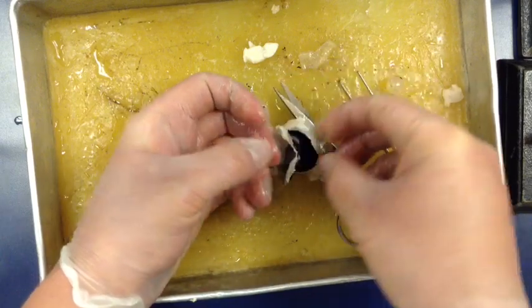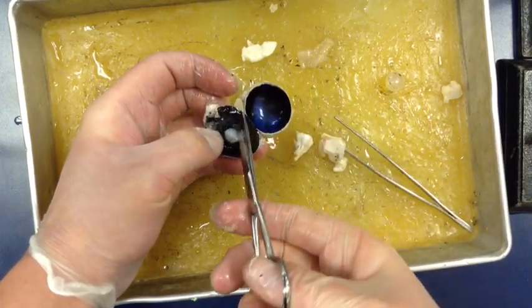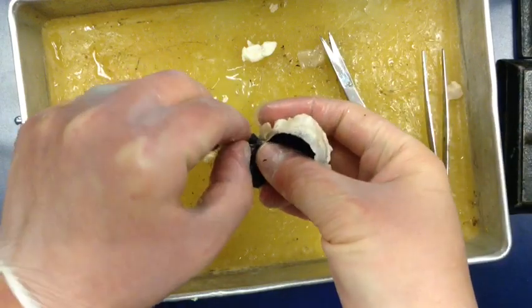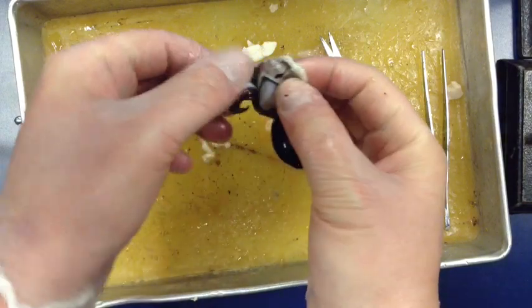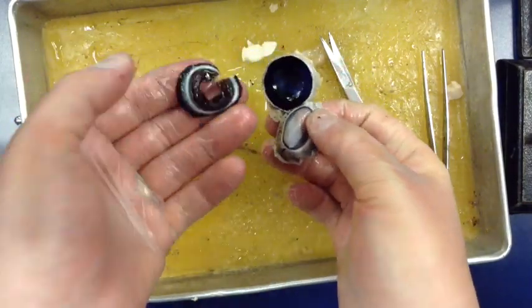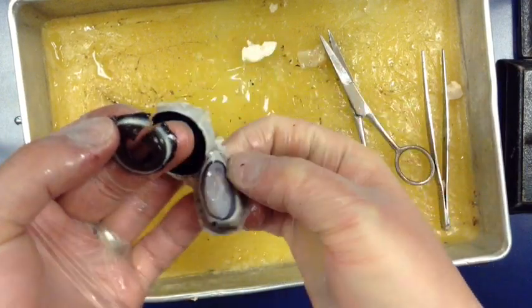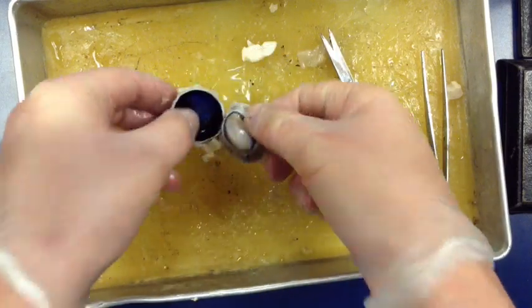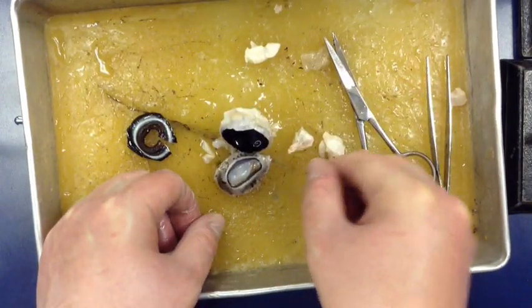If I pop this off, you can see the iris right there - the colored part of the eye with the hole being the pupil. And in my hand here, the clear part - that's the cornea. That's pretty much the sheep's eye dissection in a quick six and a half minutes. That's all you need to know.